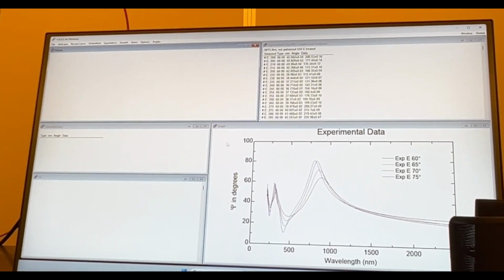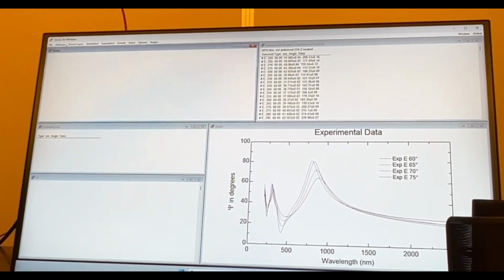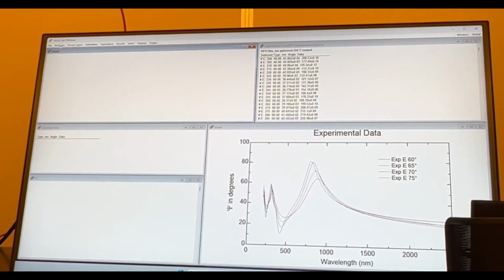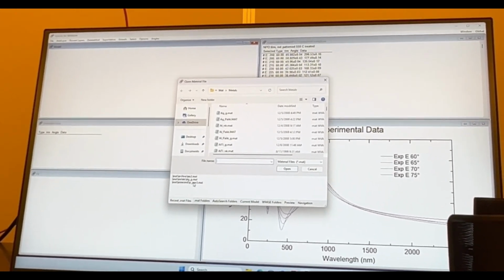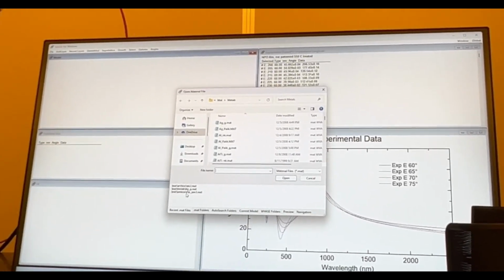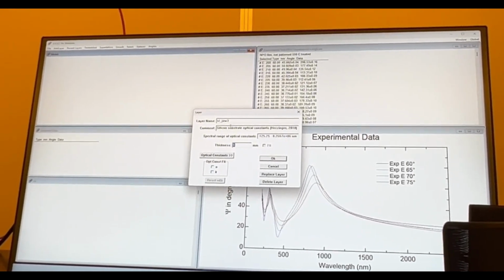Okay. And then we're going to add. If you had a model pre-built or environment, we could start from that. We don't have that, so we're just going to go from scratch. So I'm going to add a layer. Similarly, if we had added it recently, then it'll be in this list here, or you can go search for it in different areas here, or type it in. So this is on silicon, right? So I'm just going to add SI Jaw 3.